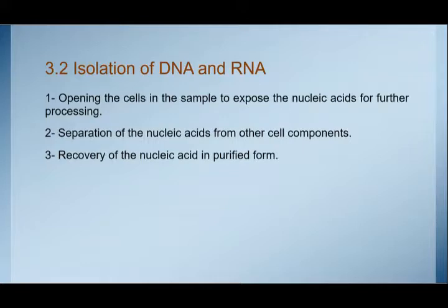Isolation of DNA and RNA. Every gene manipulation experiment requires a source of nucleic acid in the form of either DNA or RNA. It is therefore important that reliable methods are available for isolating these components from cells.